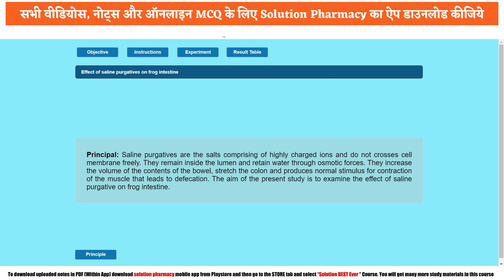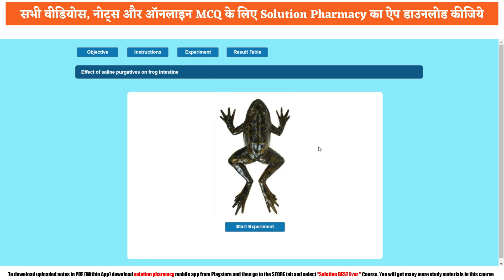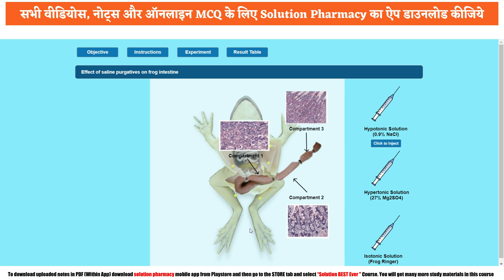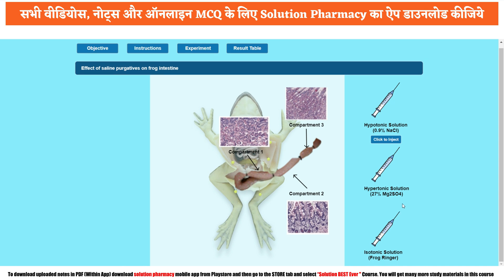Go to the main experiment section. Here you can see a frog. Click on the pop-up 'start experiment.' Once you click, the frog has been dissected and the intestine is separated into three compartments: compartment one, compartment two, and compartment three. Respectively, we have three injections containing different solutions. The first is hypotonic solution comprising 0.9% NaCl. The second is hypertonic solution containing 27% magnesium sulfate. The third is isotonic solution of frog Ringer's.